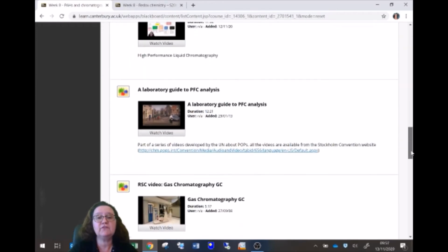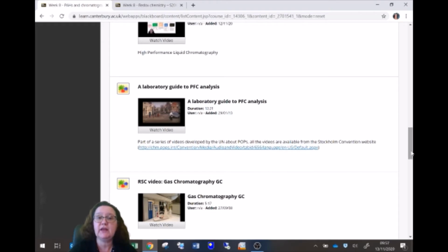You also have a video called A Laboratory Guide to PFC Analysis, and that's one video developed by the UN as part of the Stockholm Convention. It is available from their website. As a reminder, the Stockholm Convention is the one that covers PAHs, the regulation on polyaromatic hydrocarbons and persistent organic pollutants in general. And it's a textbook example of how you use chromatography in an environmental context, how you actually do these experiments and monitor, in this case, a persistent organic pollutant in the lab.